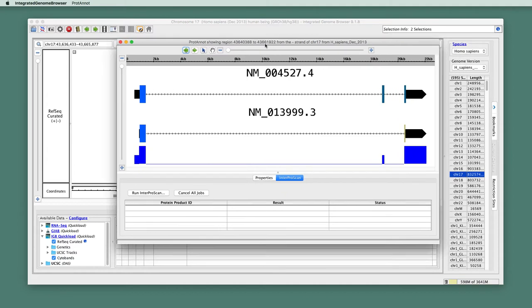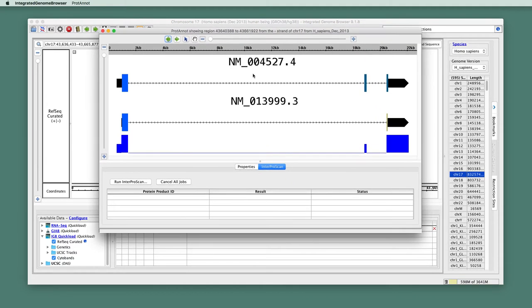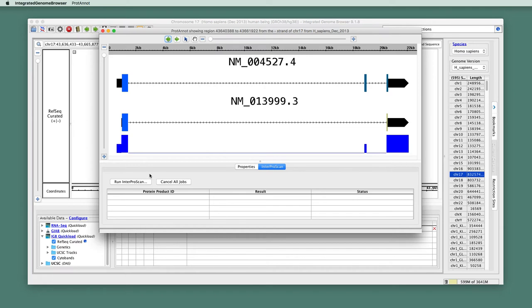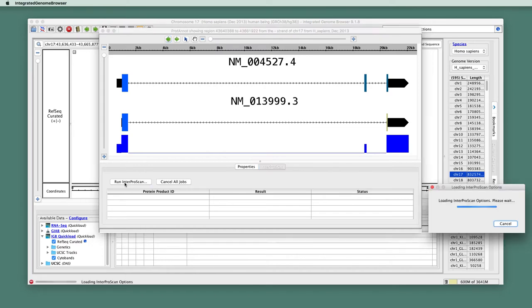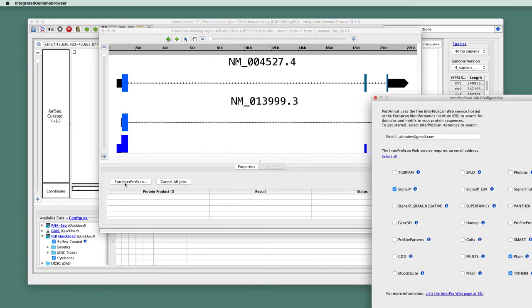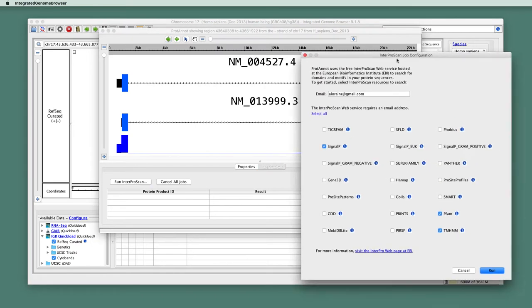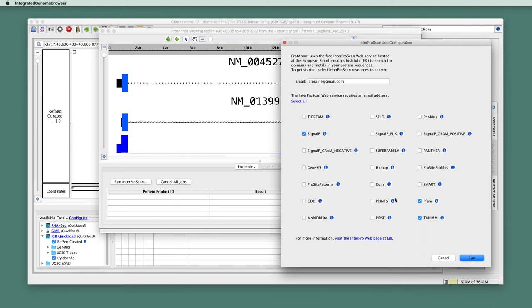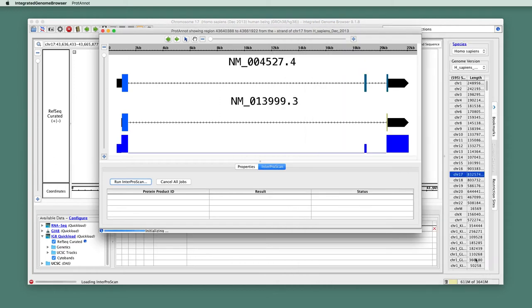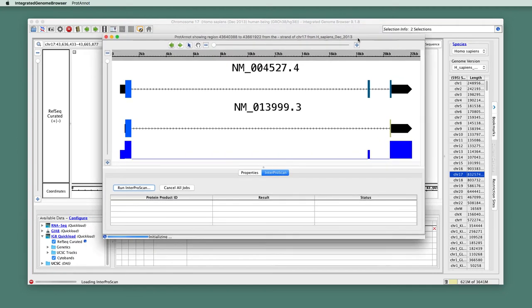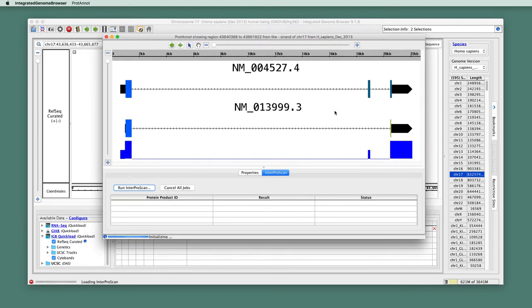So to run ProtAnnot, what ProtAnnot does is it will send a query to a remote server asking the server to search for conserved motifs in the gene models on display. So to run it, we just click Run ProtAnnot, Run InterProScan, and we are shown a new screen where we can select the different libraries that we'd like to run. I'm happy with these selections, so I'll just click Run.